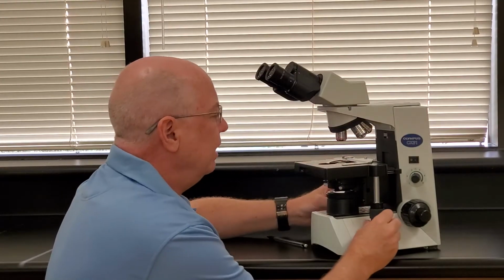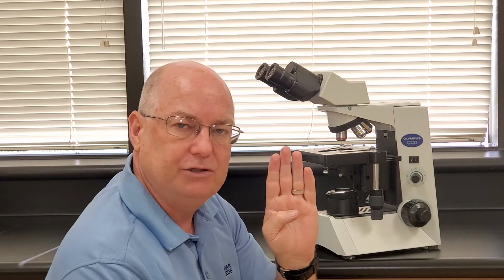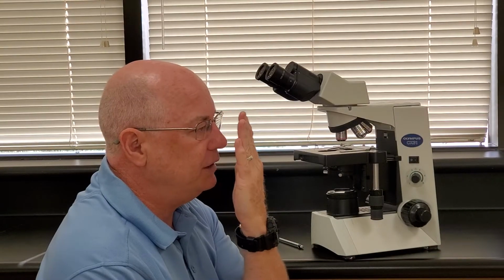I have a lot of clearance here. I mount the slide, I center the slide, and then the next thing I'm going to do with the red objective in place is raise the slide all the way up. That would be like you saying, okay, Mr. Long, put your fingers at the end of my nose, and now there's only one direction I can go.